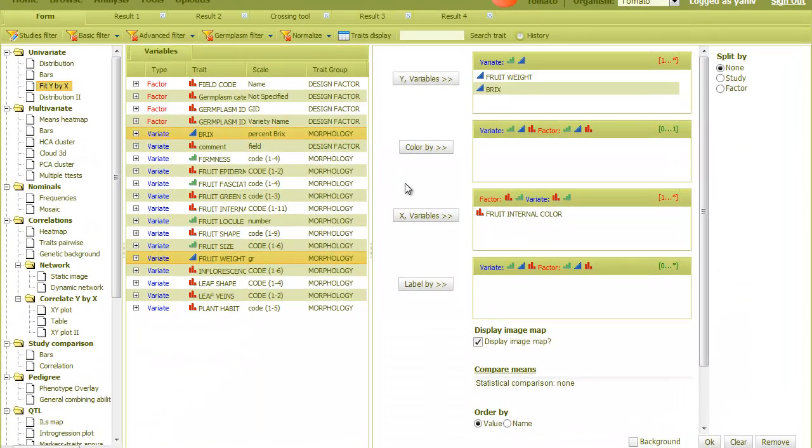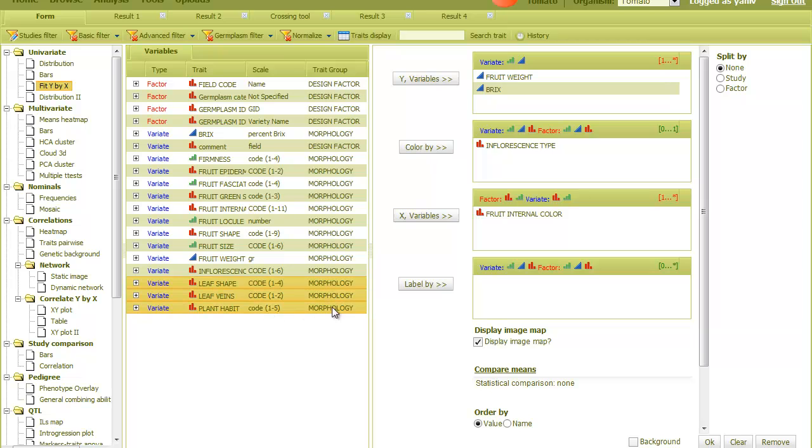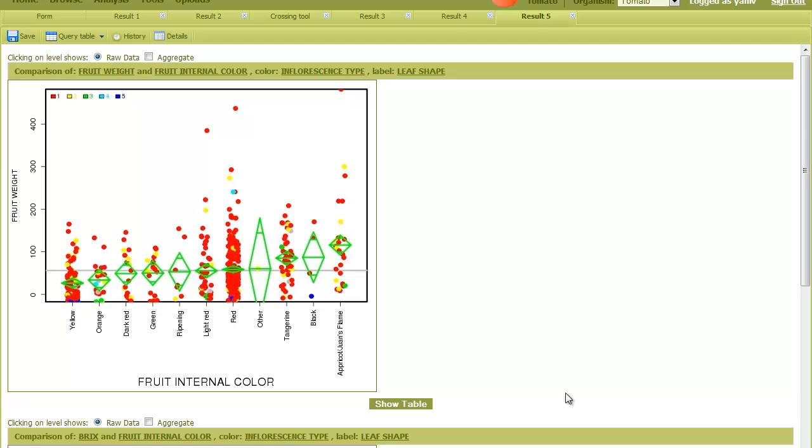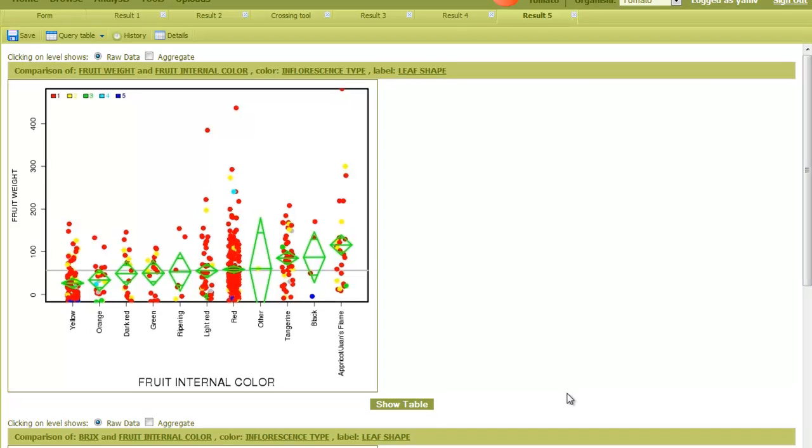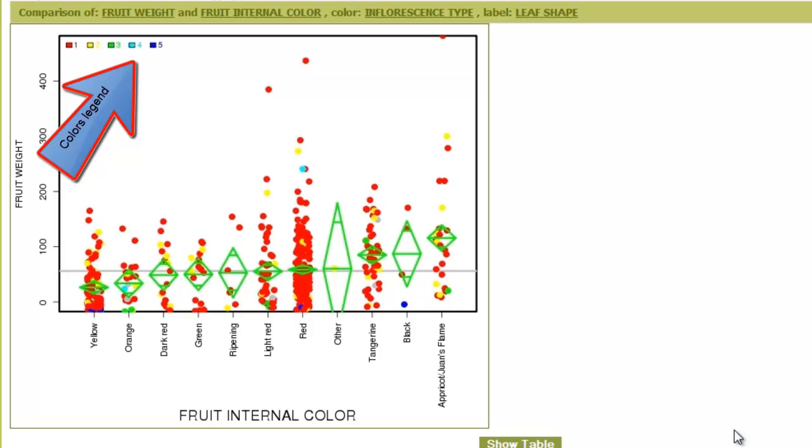Going back to the form, we can now use the color and label fields. Here I put a variable into the color field. Let's take this one, and I'll put three variables into the label field. The result now shows data points color coded according to the variable we put into the color field. On the top, there is a legend that shows the value for each color.